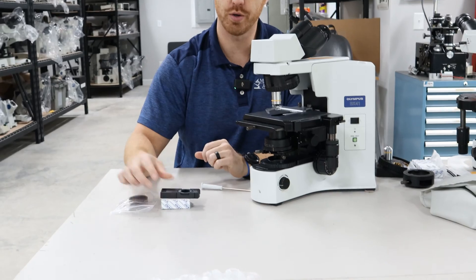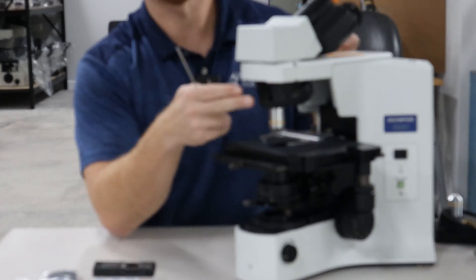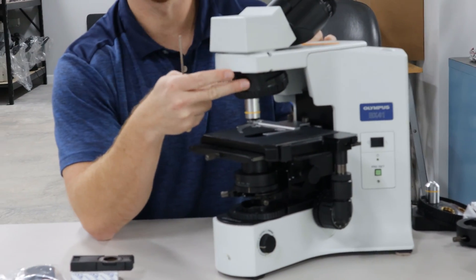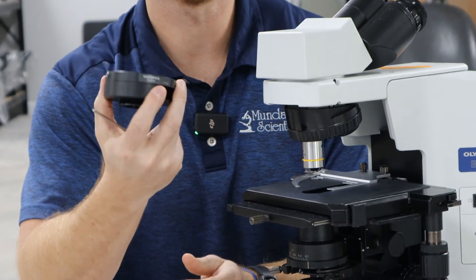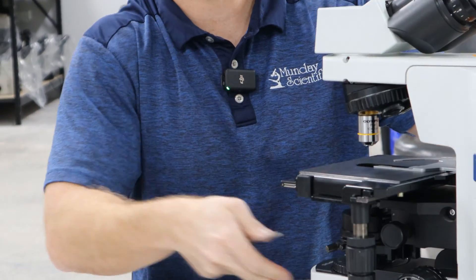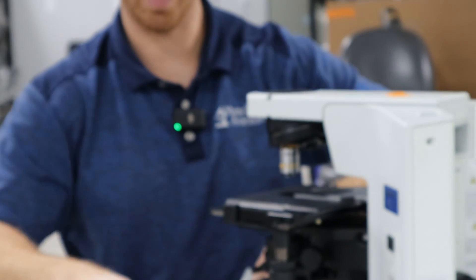So you've got your analyzer, your U-ANT, and your polarizer that fit on this microscope, but you have a five-place nose piece. There's no slot for the analyzer to go there. There are one of two ways you can do it. You can use an Olympus U-KAPA, and that intermediate piece will work as a riser as well as an analyzer holder.